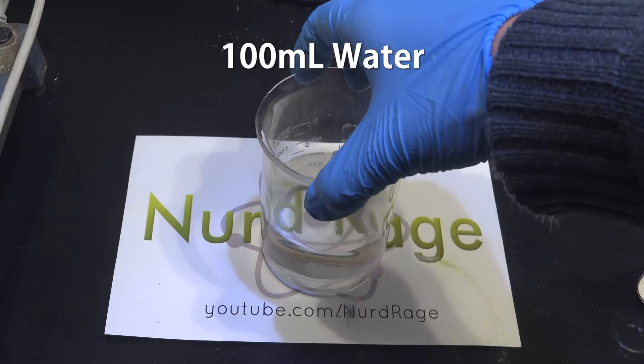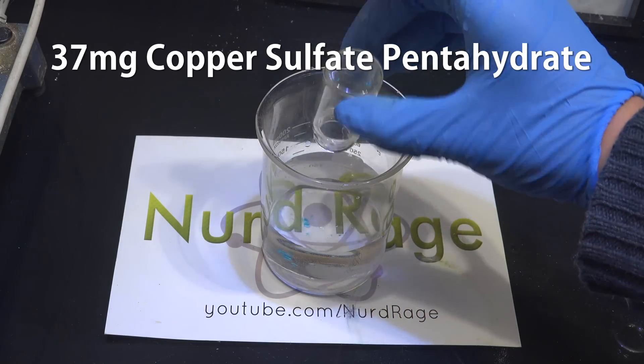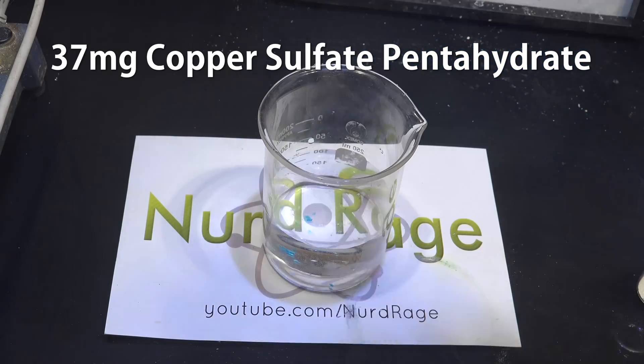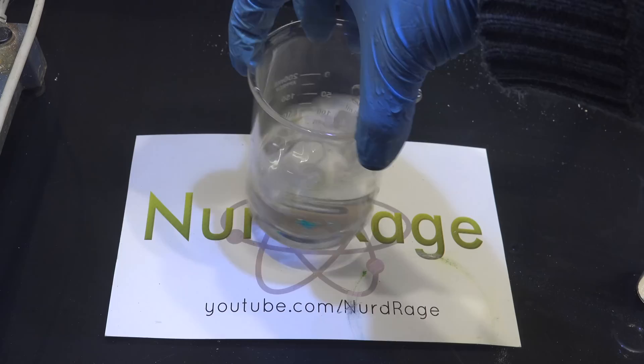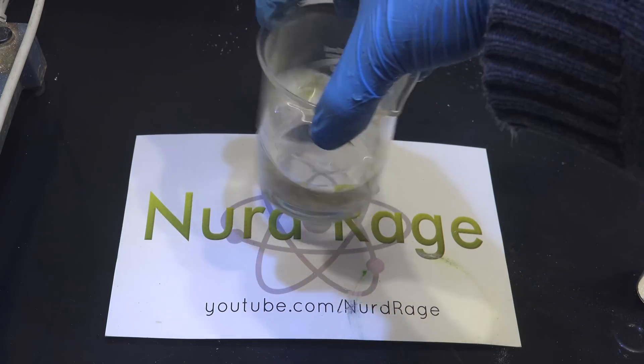First we get about 100mL or so of distilled water and add to it 37mg of copper sulfate pentahydrate. This needs to be dissolved separately first because if mixed directly with the rest of the chemicals, it tends to clump due to precipitation.